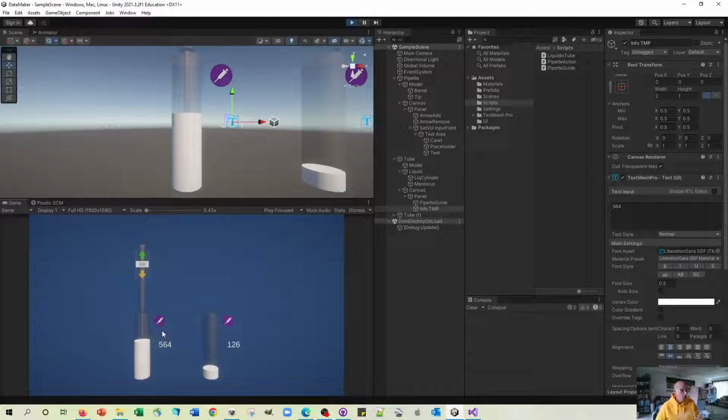One thing that we might want to do actually is when we add, it might be better if this panel with the arrows and the amount stays in the same spot, because it is a bit disconcerting the way it moves up and down, because it means you have to change the position of your mouse. But that's something we can do next time.